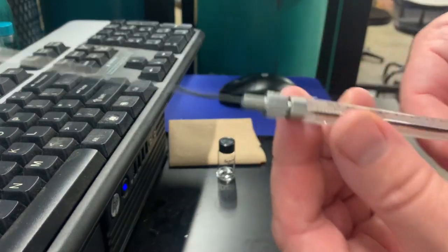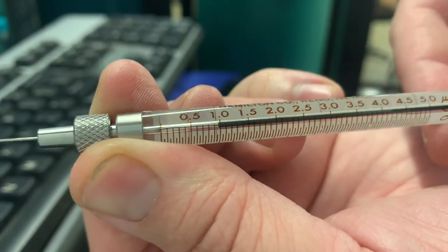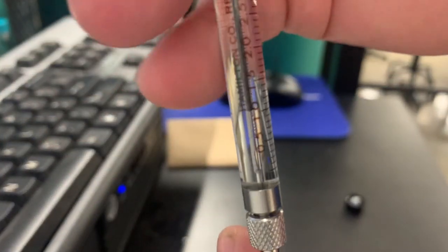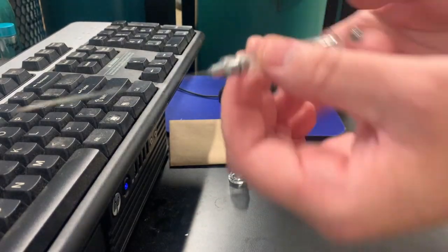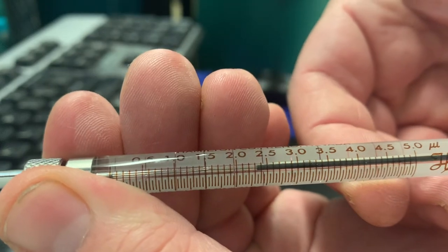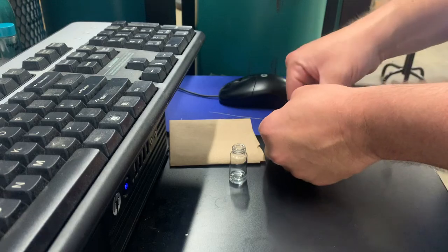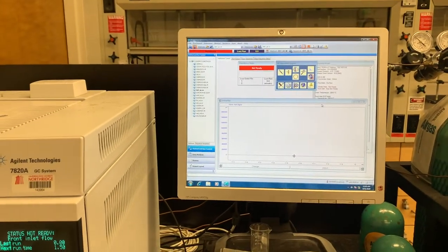And we can take our syringe again. If we look here at our syringe, we want to start off by bringing it to 1. So that's for air. And now we can take our sample, and I'm going to very carefully bring this up to 2. See, we're at 2, and I'm going to pull that back to 3. Now this is a 5 microliter syringe, so you might not see it. For a 10 microliter, you will see it, but we have that prepared. So now when that is ready, we're going to come here, press prep run, and wait for it to tell us once again that it's ready.